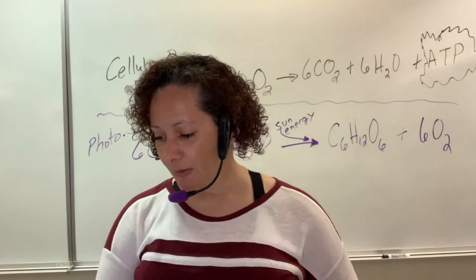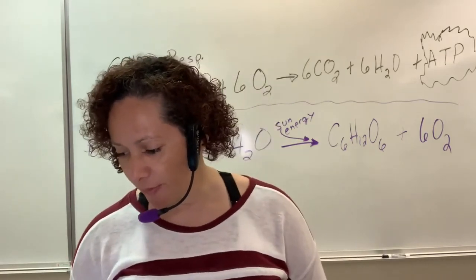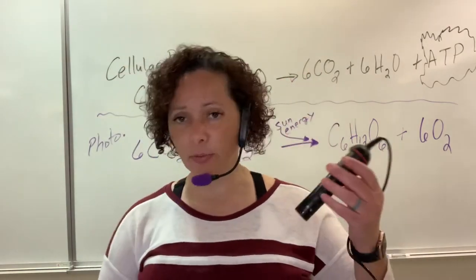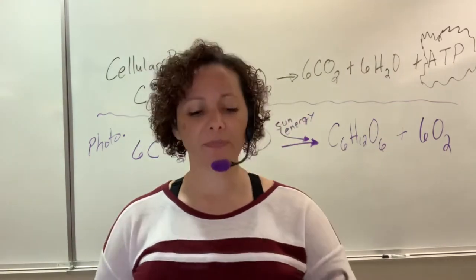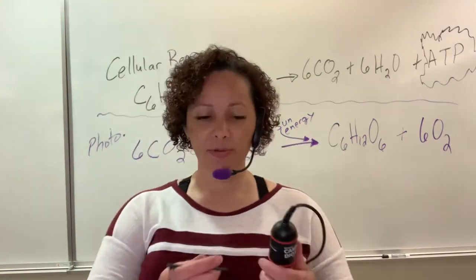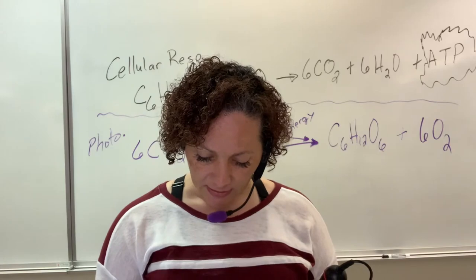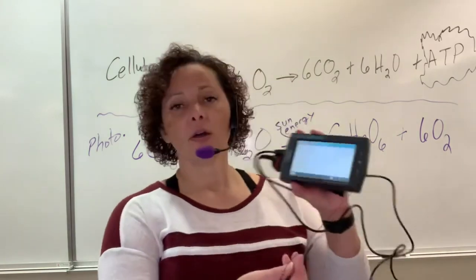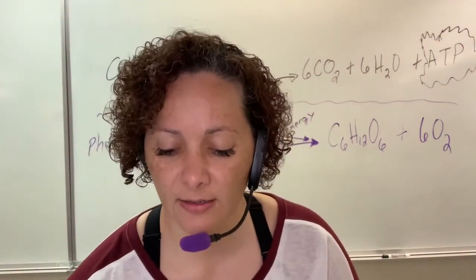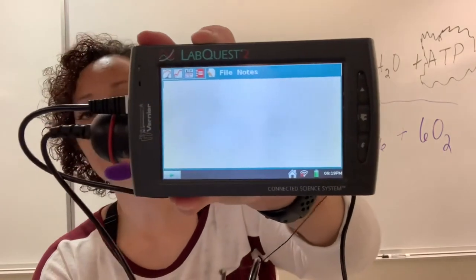So from there, you're going to go ahead and set this. It says enter the pointer into the calibration. So we need to calibrate this. As you calibrate it, there's a little hole on the back side. You're going to place the pointer into the calibration button. If you find you have stuff on here, why don't you empty it? See, I have things on there that are in the way. Let me go ahead and erase.